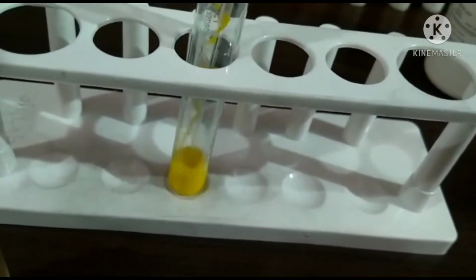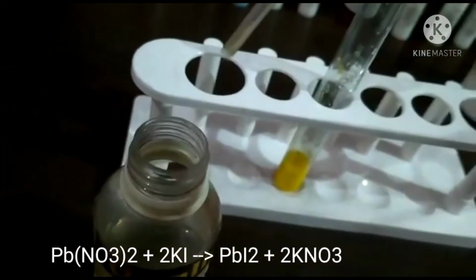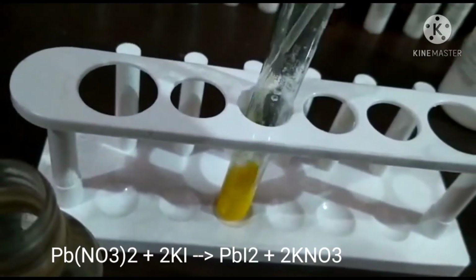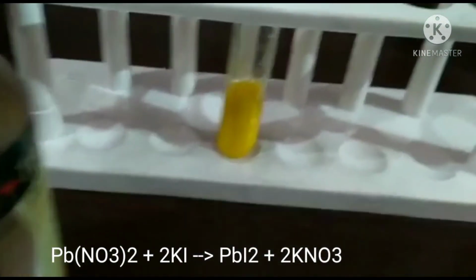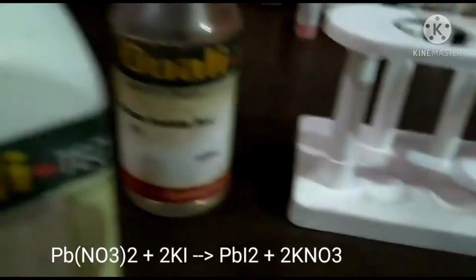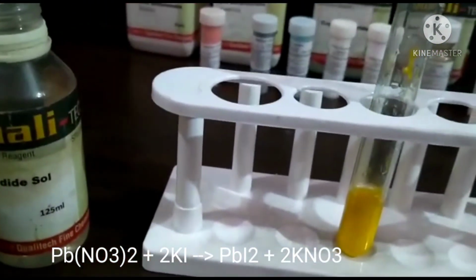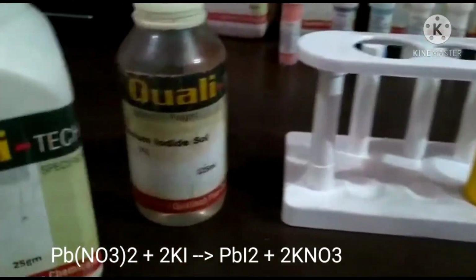Lead nitrate is colorless. I am adding potassium iodide using a dropper. You will immediately see the formation of a yellow PPT. Look, you will immediately see the formation of a yellow PPT. How is this yellow PPT formed? Actually, when lead nitrate reacts with potassium iodide, there is a formation of lead iodide.